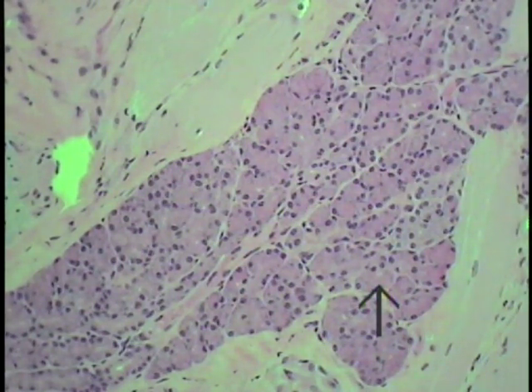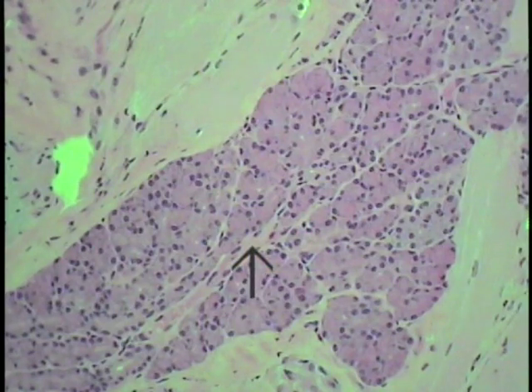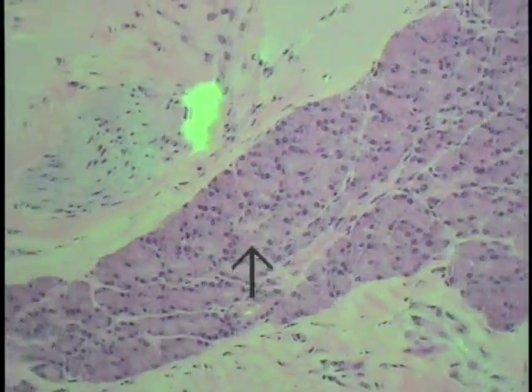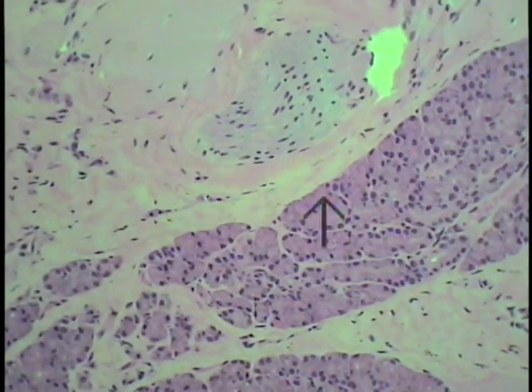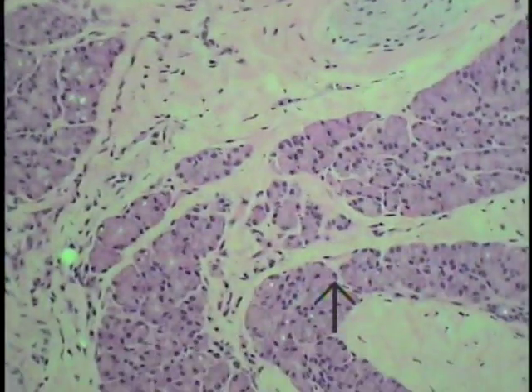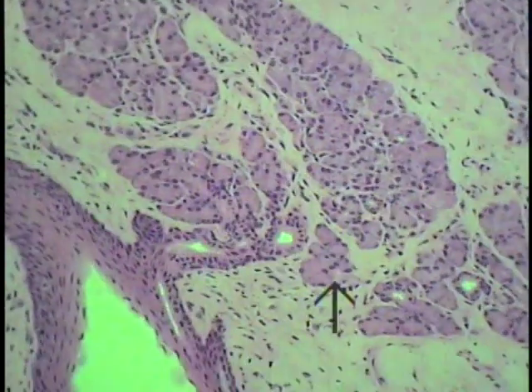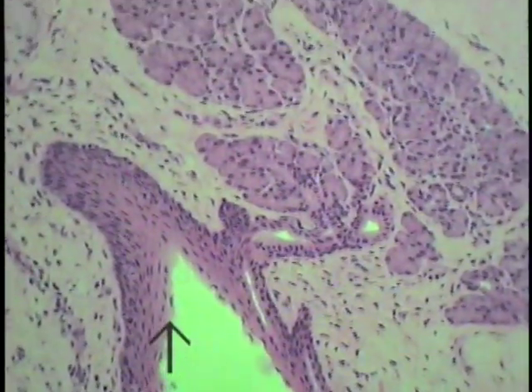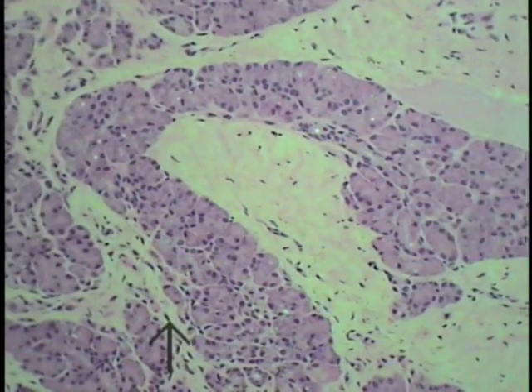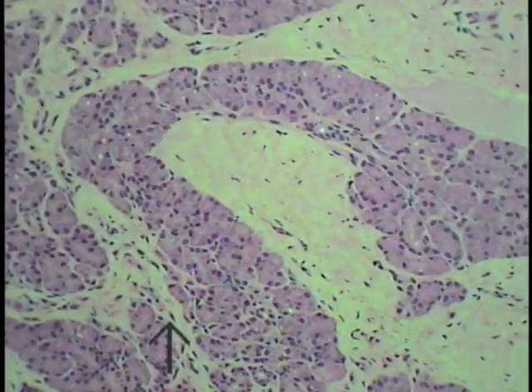The minor salivary gland associated with the circumvallate papillae — von Ebner's gland — is purely serous. One is shown coursing in the center of the field. Tracing up toward the base of the circumvallate papillae, this purely serous gland's ductal system joins other compound tubular alveolar glands and empties into the moat surrounding the circumvallate papillae. These are among the few purely serous glands found in the oral cavity, specifically associated with the tongue and circumvallate papillae.